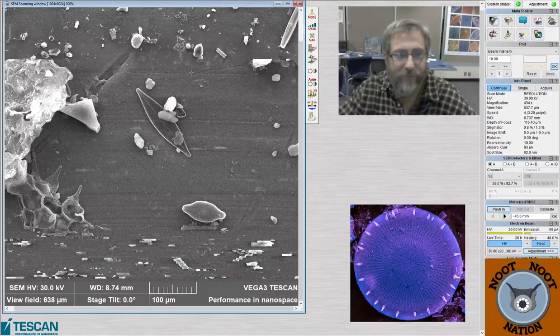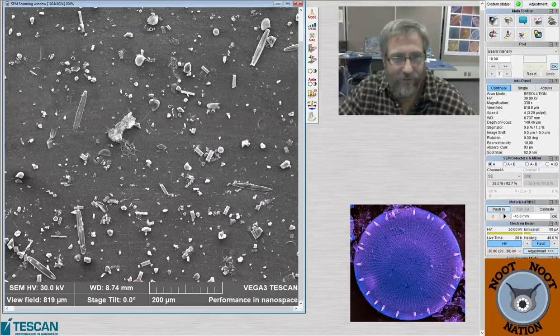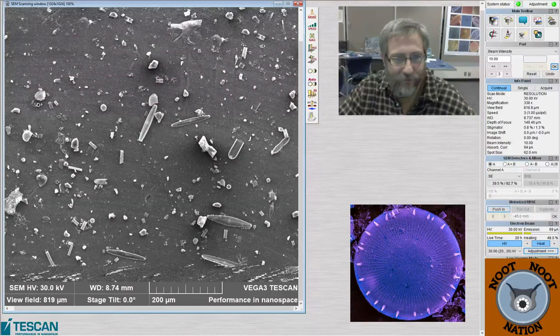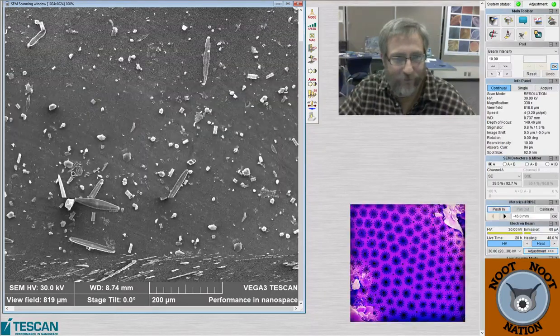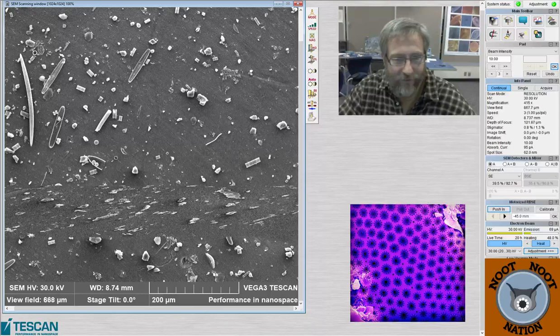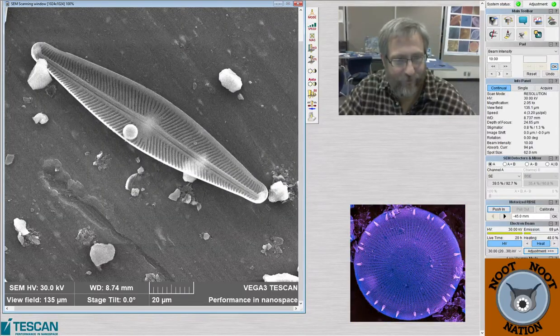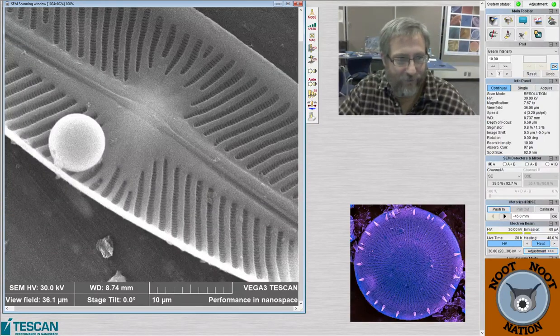All right. It's getting close to closing time, I think. It'd be a good time for me to find us one last good thing to look at, hopefully. And what's a sponge spicule? What's this guy? Plain old navicula. He's got a friend. A chrysophyte friend.